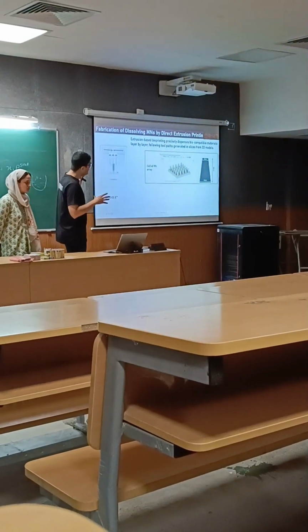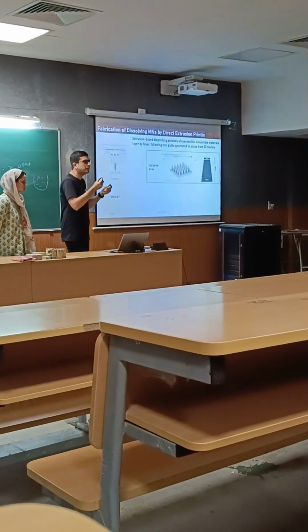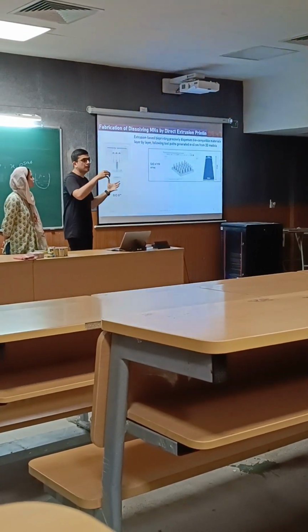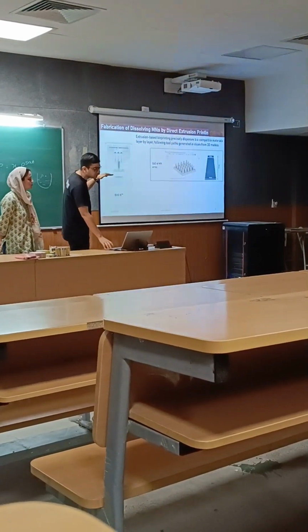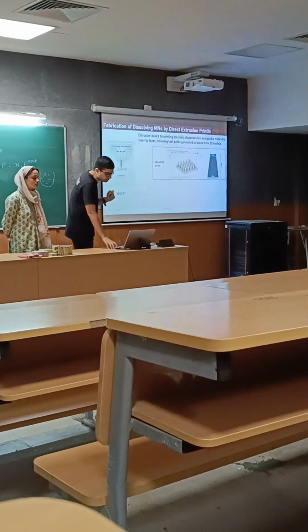But this is kind of a proof of concept, so it can be extended if you have a very small nozzle. We use a pneumatic pump here. If you have a high capacity compressor, you can also print in this same fashion, quite ultra fine and micron size structures.